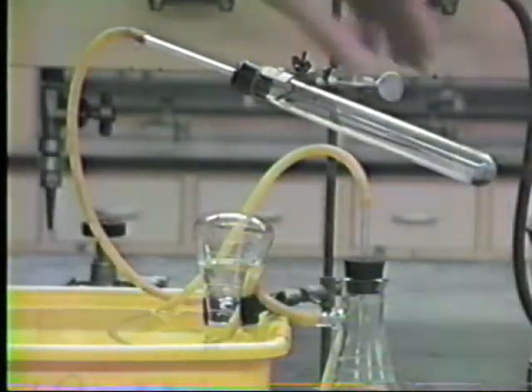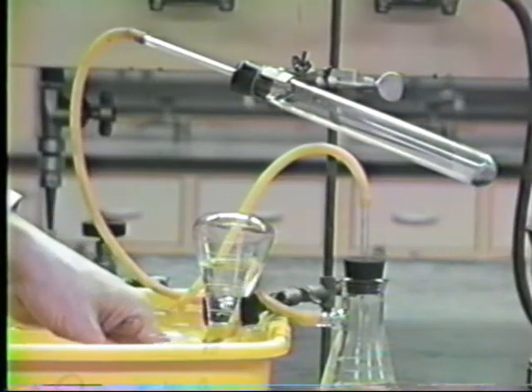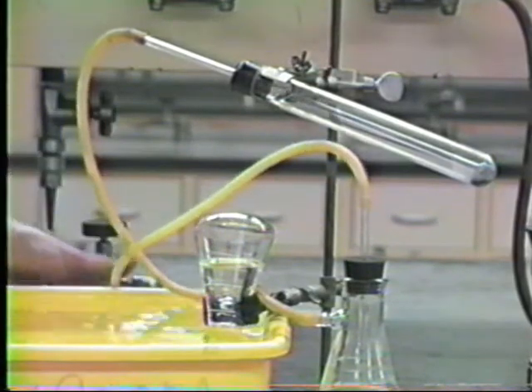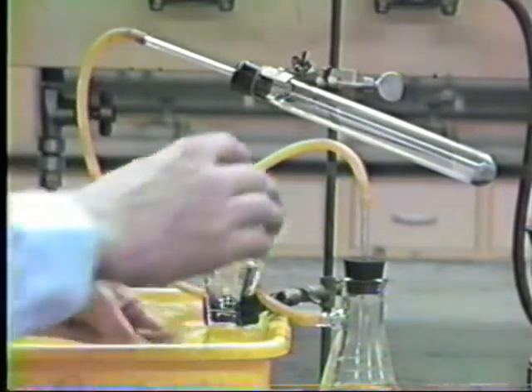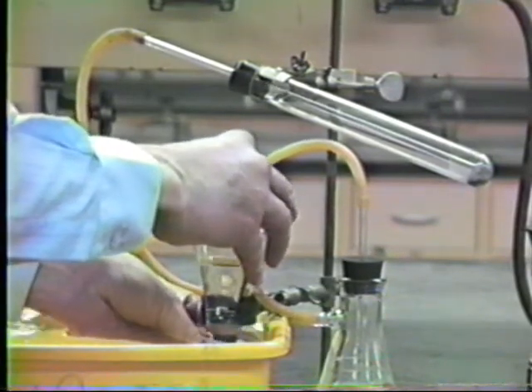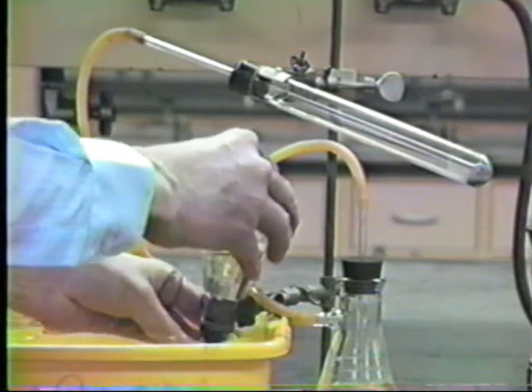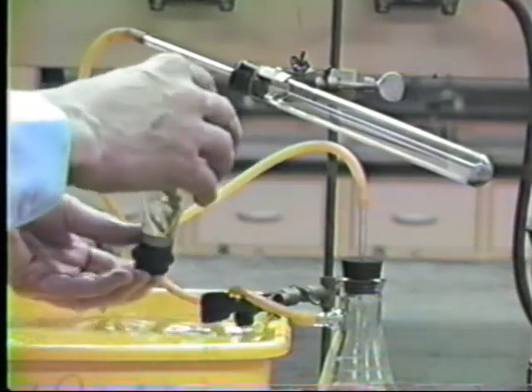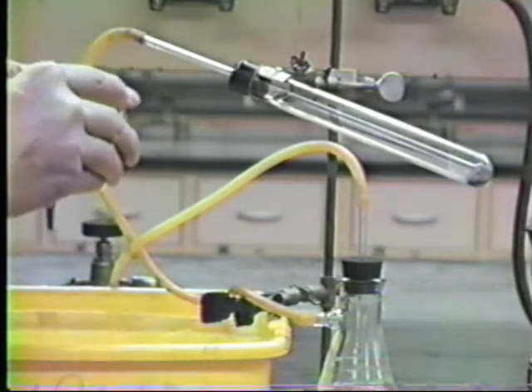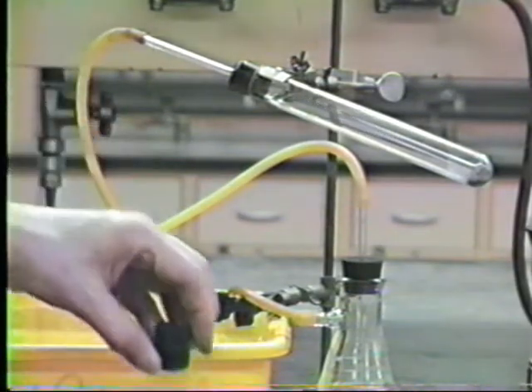When the system has cooled to room temperature, what you simply do is you remove the delivery tube, take your rubber stopper and stop her tightly so that there is no loss in gas or pressure of this tube, and then you can take it, making sure it's tight so you don't lose anything in here, to the leveling tank.